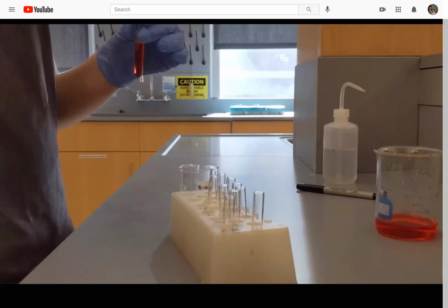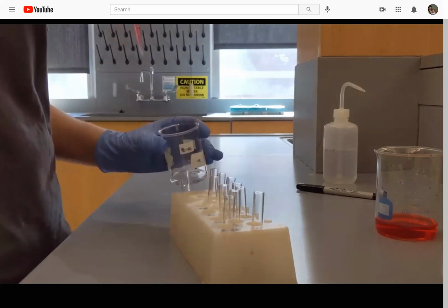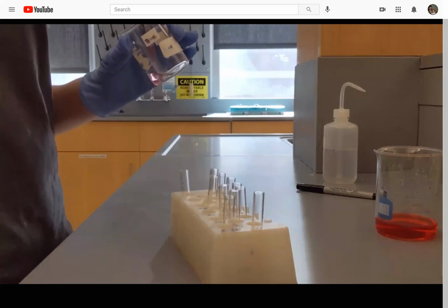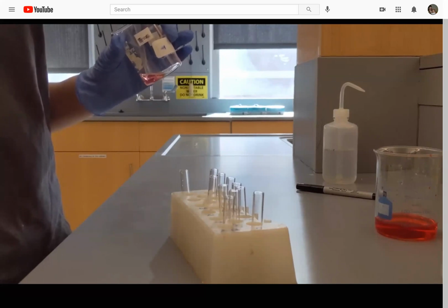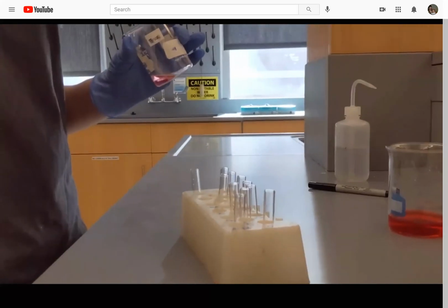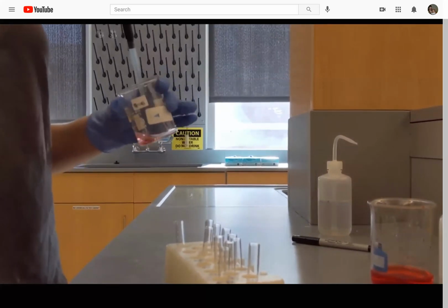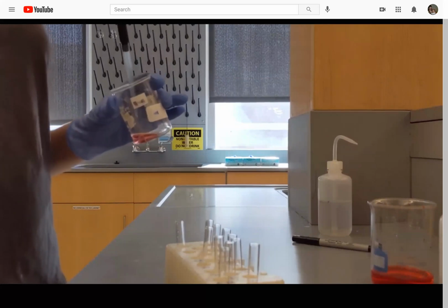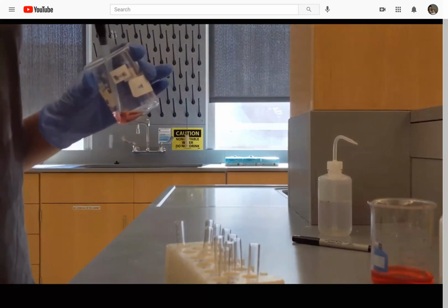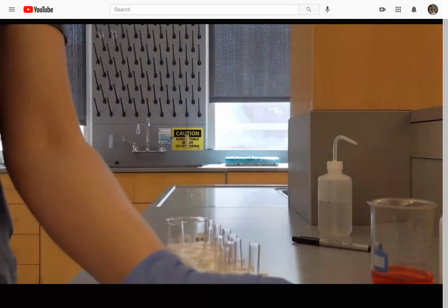And I'm doing this in a beaker because the amount needed would not fit in these small test tubes. So to make sure that I don't overflow them, I've gone ahead and made it in a beaker. Now I'm going to mix that to make sure it's nice and mixed. And now I'm going to add a small amount to our cuvette.